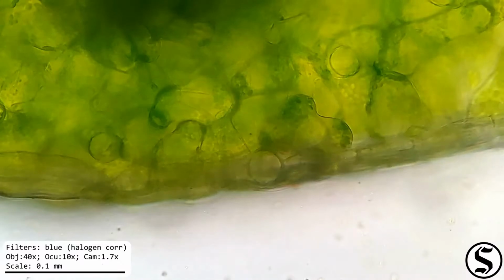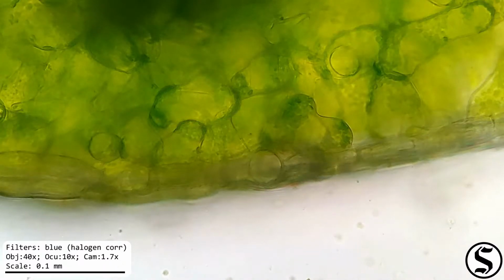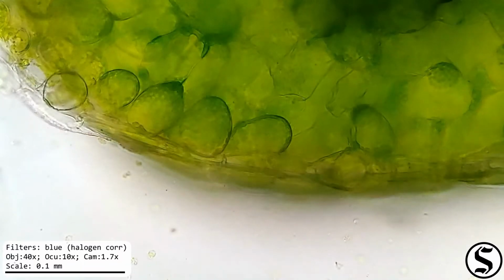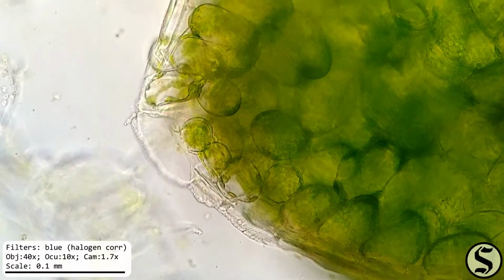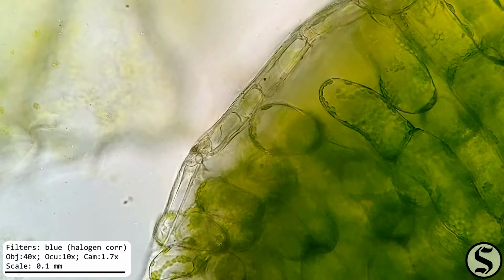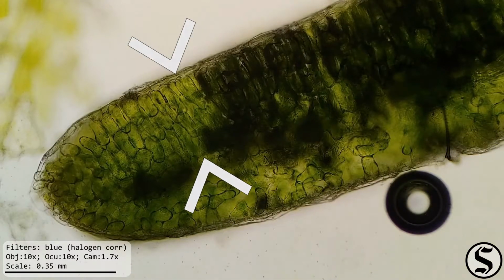And we can see that they're sort of strangely shaped to leave a lot of space in there. That's so that it's lightly packed for efficient gas exchange. As we go around, oh, there's a stoma. There's another stoma. Alright, now let's check on that top layer.